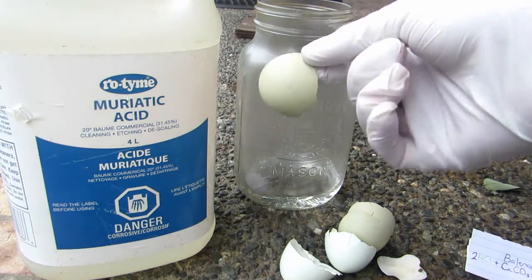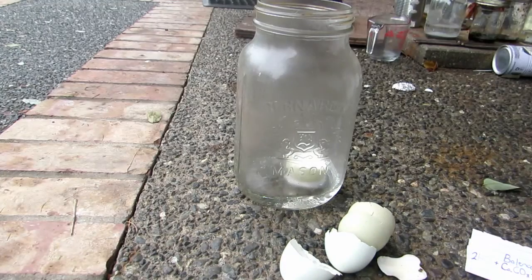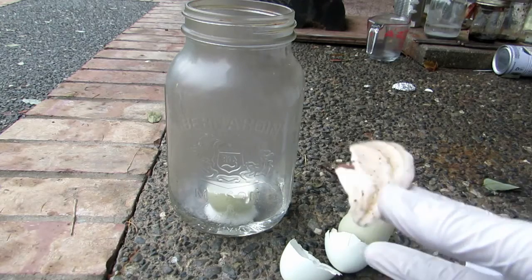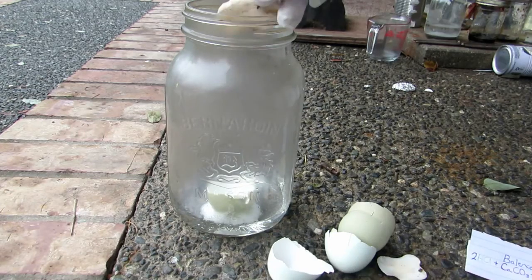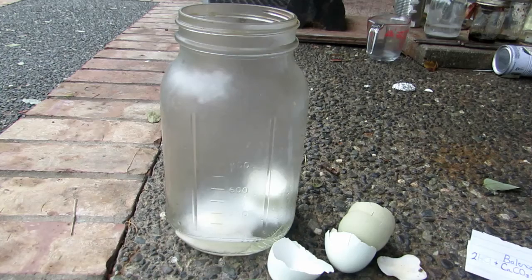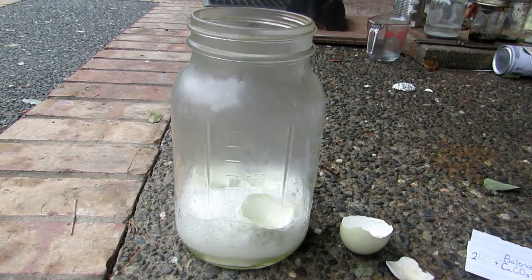We can now start by adding something to the hydrochloric acid, such as this eggshell, which is primarily calcium carbonate. A vigorous amount of bubbling will occur and your solution will heat up quite a bit. It is important to do this in a very tall container — this can produce a lot of fizzing and bubbling, especially with impure sources such as seashells. You can see a very vigorous amount of bubbling occurring. It is of course important to wear gloves because this is concentrated acid.